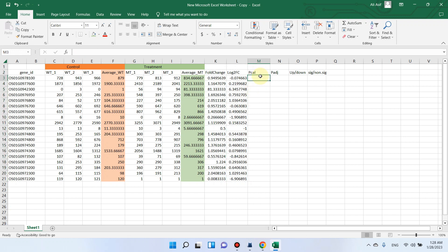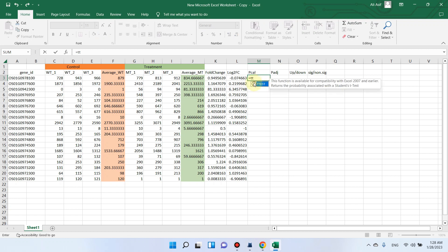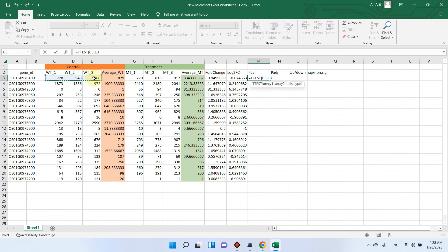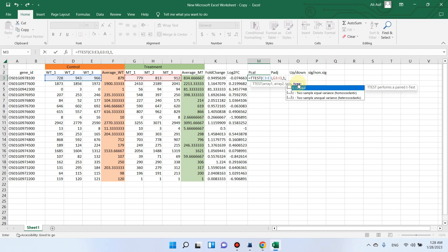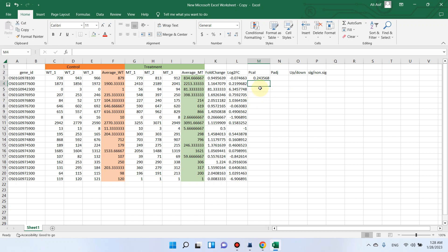The next step is to calculate the probability, so we need to apply the t-test. We start with an equal sign and go with T.TEST, then double-click on it. The first array is the wild type values and the second array is the mutant type. Because we are using a one-tail test, we enter 1, and because we are using the paired sample mean test, we select that option, then close the bracket and press Enter.